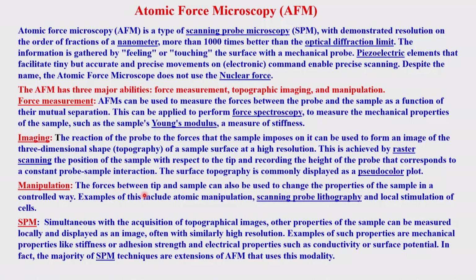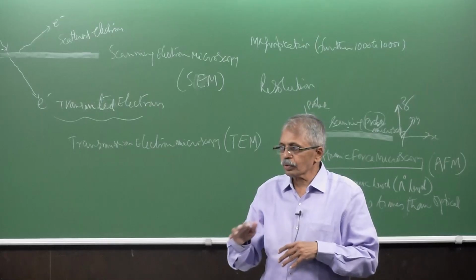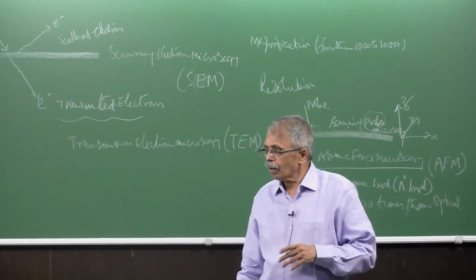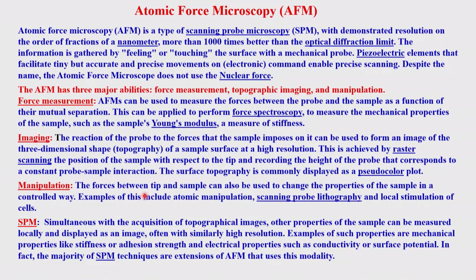All of this. So that is how you can get the scanning of the whole thing, and then connecting the whole data will give you a picture of the topology or surface image of that, and then surface contrast can be made clear by using certain kinds of colors, and those are all there in the programs already. You don't need to worry about it.